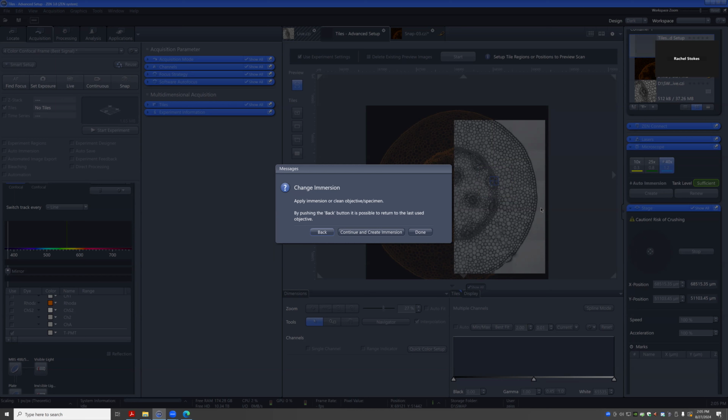You see here at the bottom, and you see the rings around the objective, like this little sponge here. That's mostly for catching any excess that goes to the side, making sure that it doesn't run into anything. It's literally connected to a tube that goes into a pump here on the side of the microscope, and then coming from the reservoir right here.